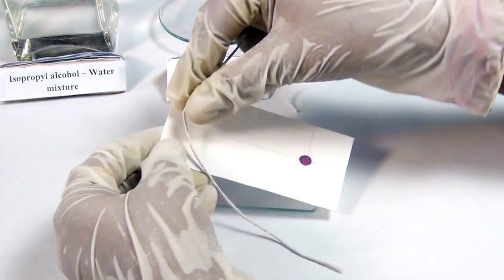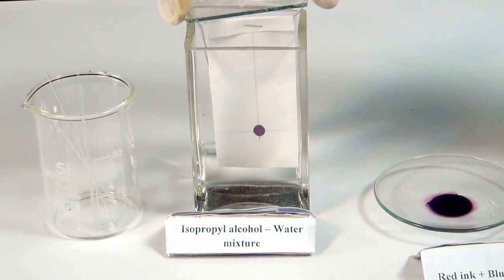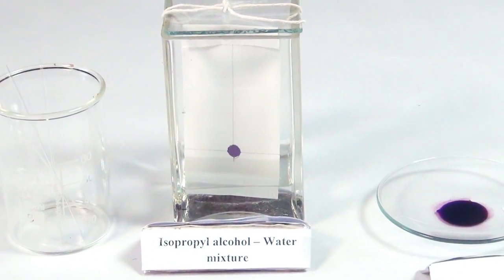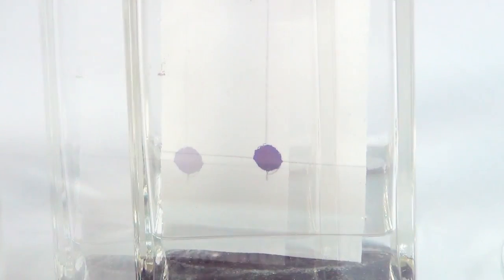Take a piece of thread and tie the filter paper to it. Suspend the filter paper vertically in the chromatographic chamber containing solvent, which is a mixture of isopropyl alcohol and distilled water. Make sure that the spot remains about 1 cm above the solvent level.